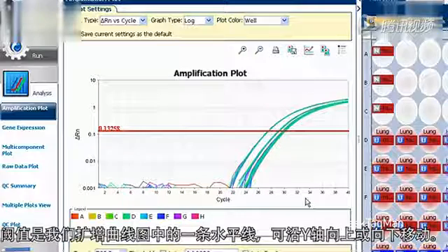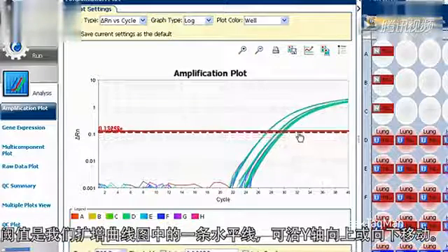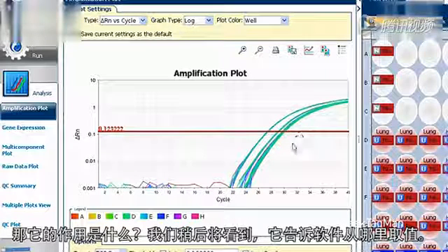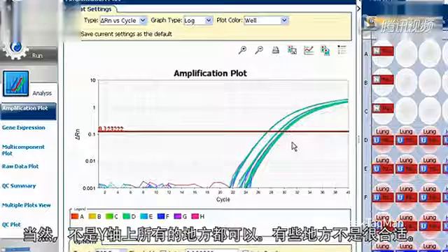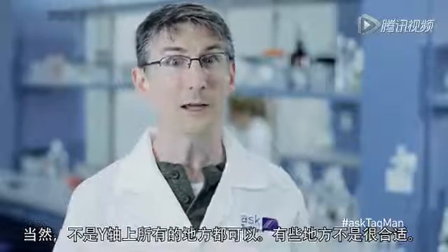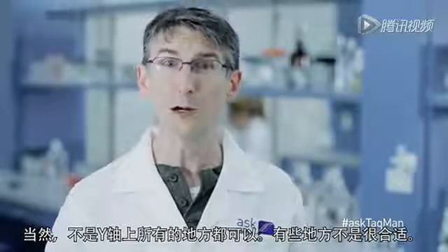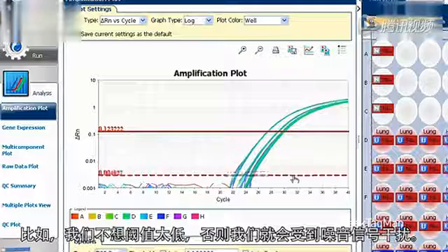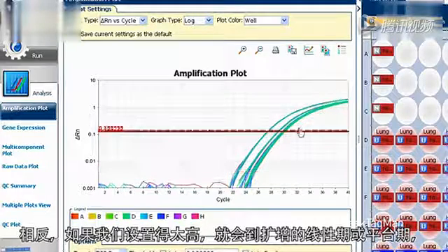Excellent question. The threshold is a horizontal line in our amplification plot that can be moved up or down on the y-axis. Its purpose, as we'll see in a minute, is that it tells the software where to take data. Now, not all places on the y-axis are equal. Some regions we want to avoid. Specifically, we don't want to be too low. Otherwise, we get down into the noise.